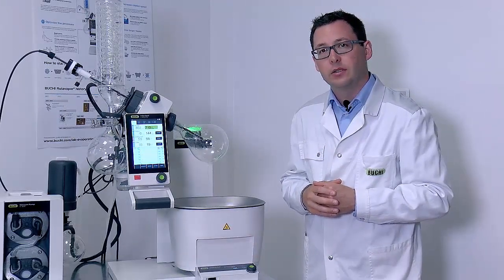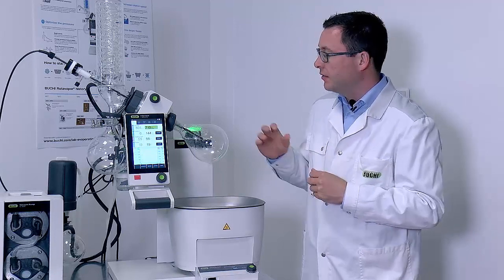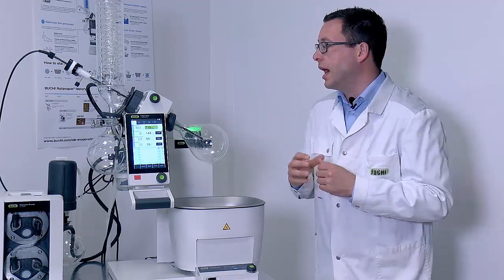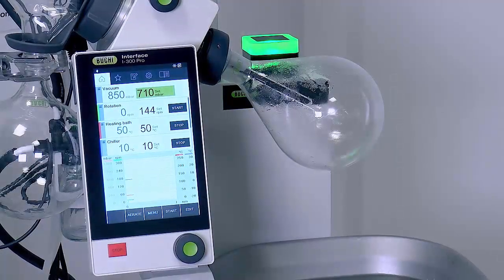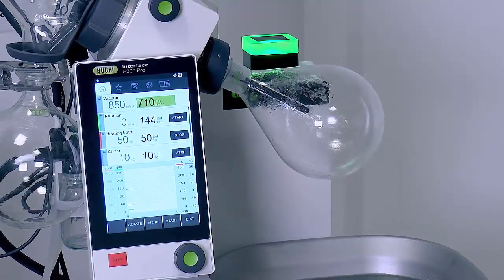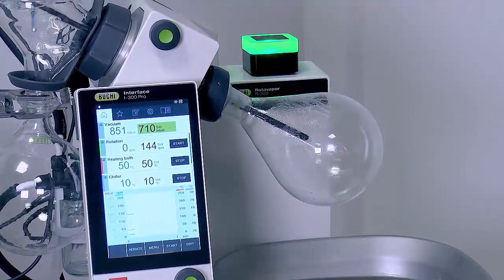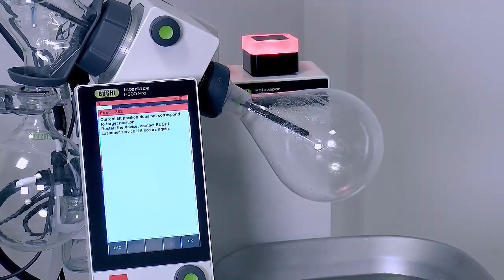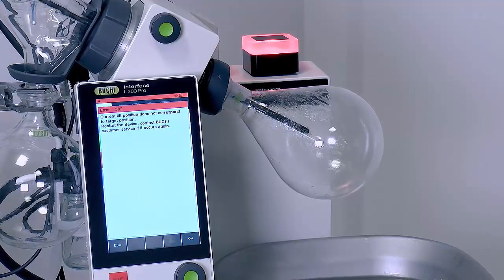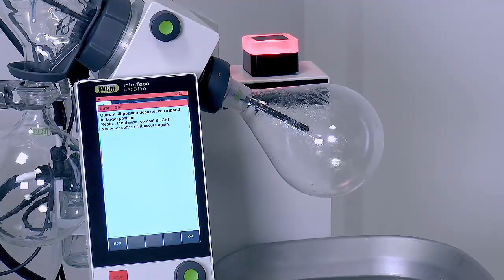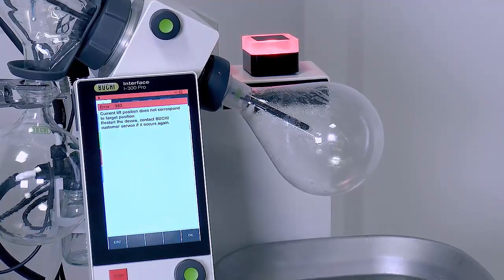Now the last thing is errors. For the errors, I would like to show you how we can provoke this. In case we have an error such as the lift, we can see that the light turns red immediately, so everybody in the lab knows that we have to pay attention to this rotary evaporator.